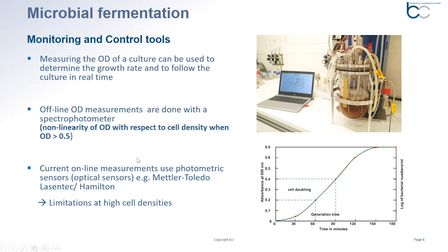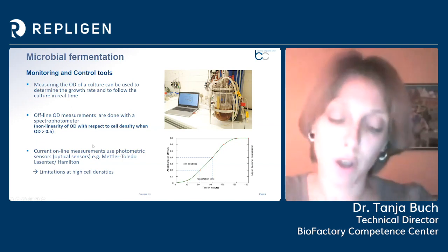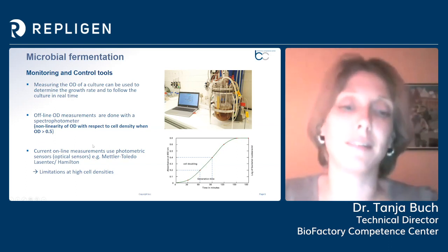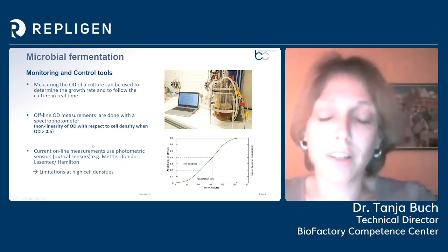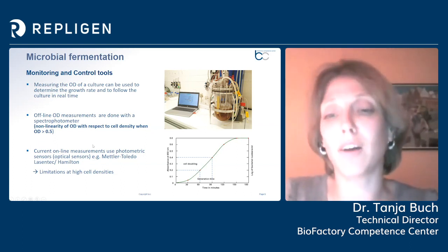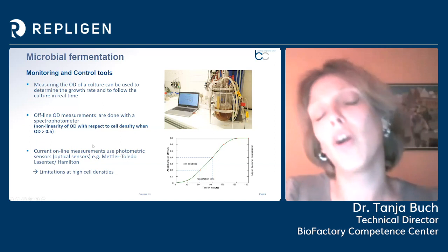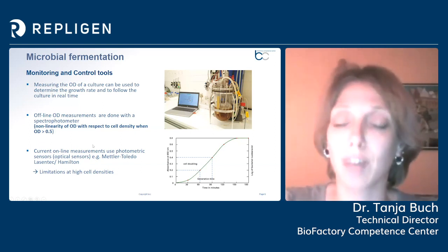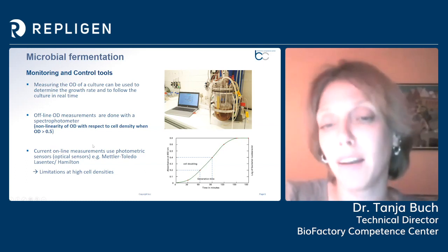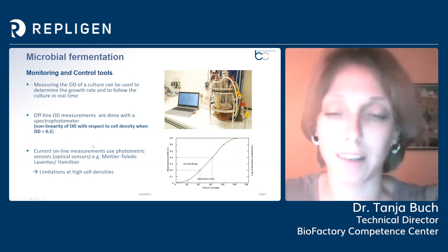So to give you one example, when we talk about fermentation processes, we usually separate them into two different phases. The first phase being the cell growth part and the second phase being the product production part. And the different phases are divided with an induction time point, which can be dependent on a temperature shift or also on a substrate shift in order to change the metabolism. But in most cases, they are dependent on the cell concentration present in our bioreactor at this given time point.